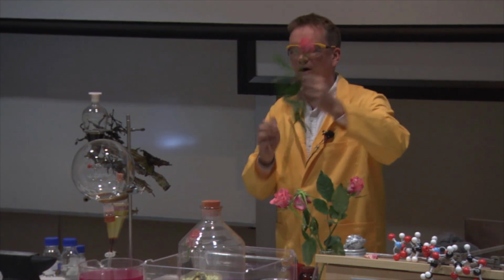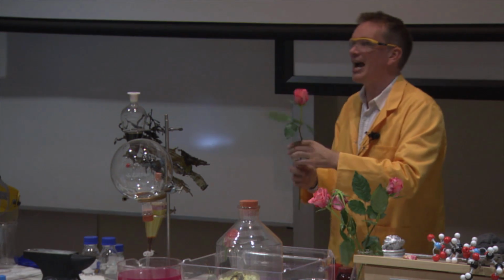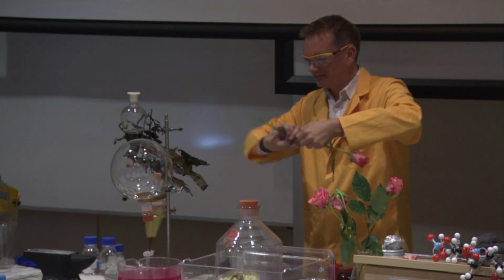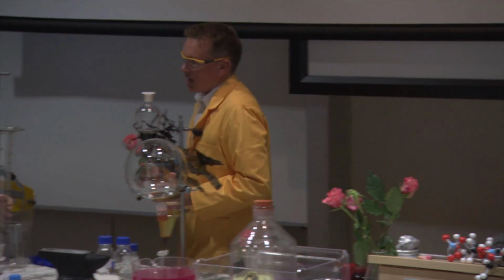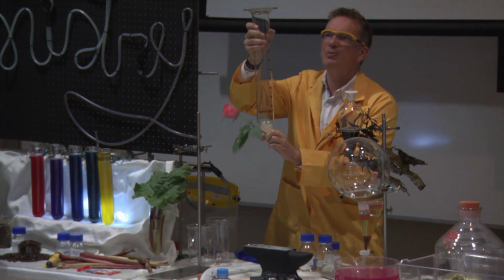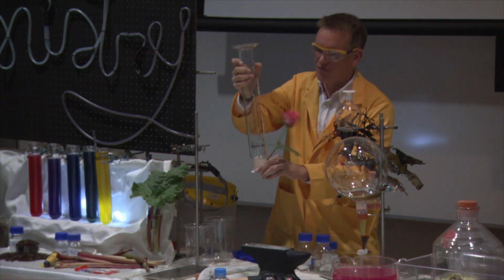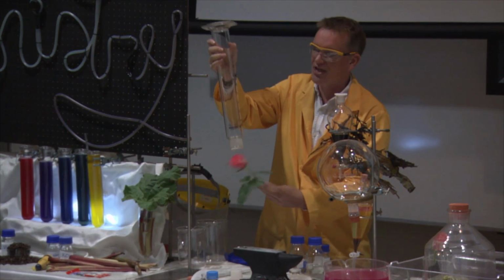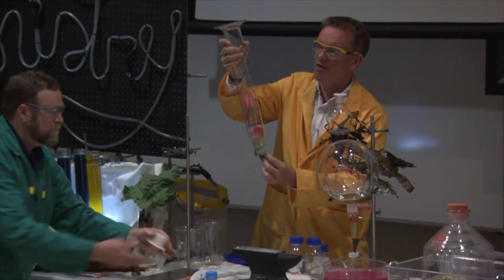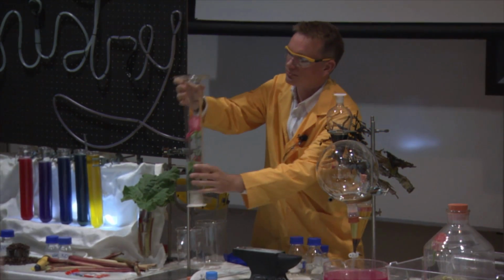Okay. So I'm going to add a rose to the ammonia, and let's see what happens to my poor little rose. Okay, so the ammonia is in the tube, and it's lighter than air, and this is because it's only got one nitrogen atom and 3 very, very light hydrogens, whereas air, of course, has 2 nitrogens combined together in N2. Just going to shove the rose in and put the stopper back on.